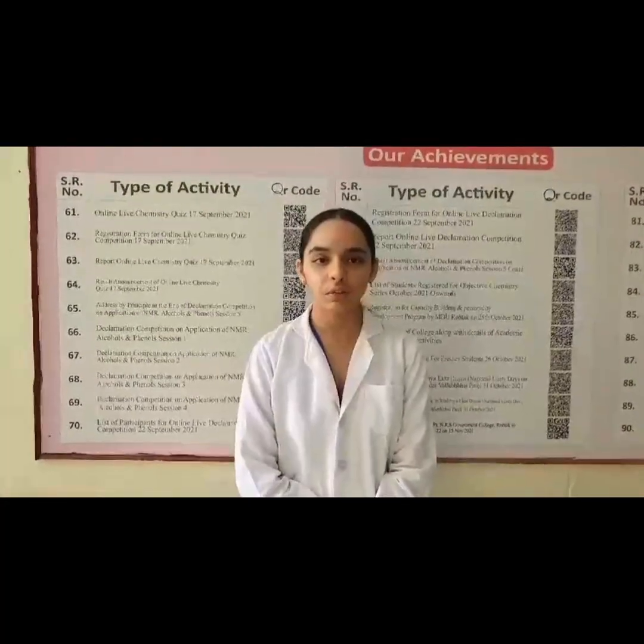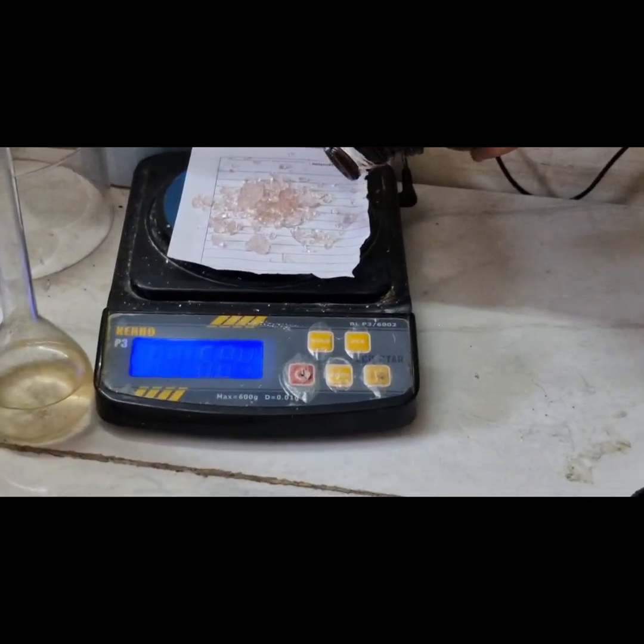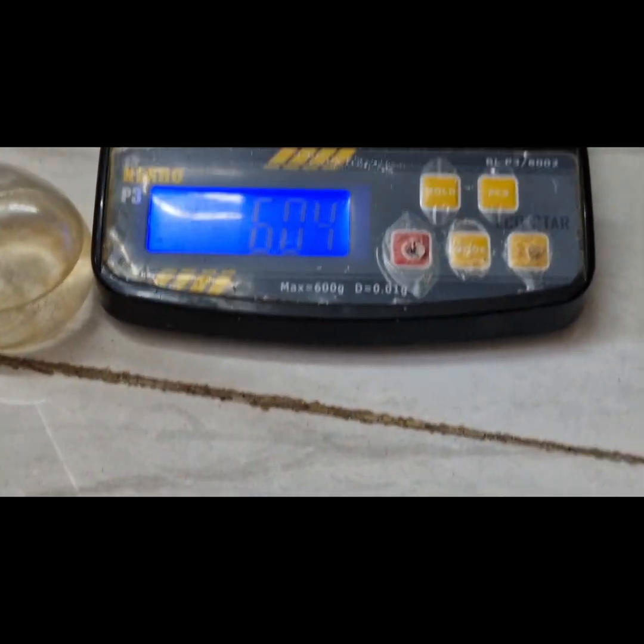Today we will perform the experiment to determine the critical solution temperature of the phenol-water system. For this we have measured 6 gram of phenol.